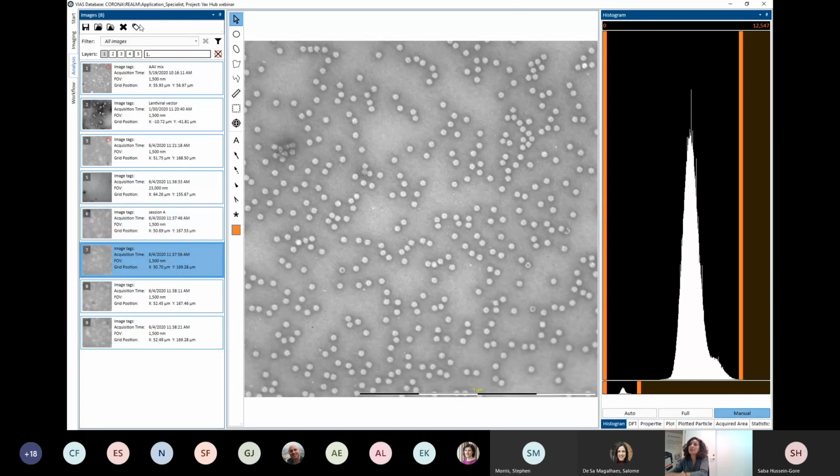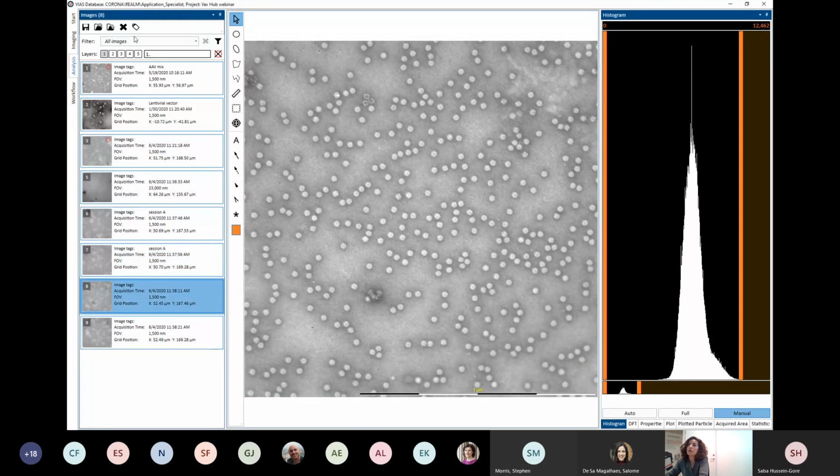And this one I can also call session A. This one I will call B. All right, it doesn't really matter what you want to call it.